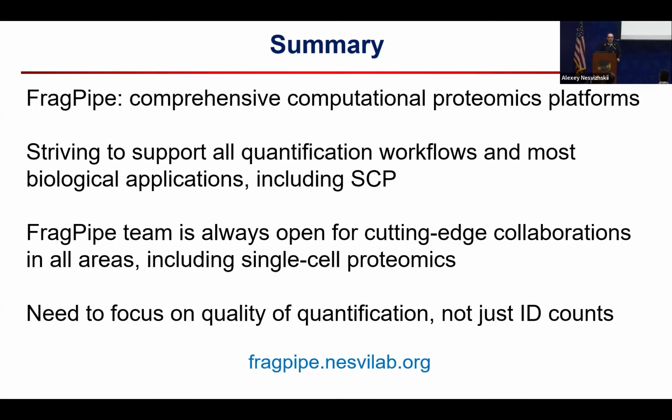It had a minimal impact using the tools that we tried at the time, which is a few years ago. I see new tools coming out, and maybe they will benefit the analysis, but I think a certain type of transfer learning has to be applied, because you can't train it on a gazillion data from the average proteomic study, right? You see what proteins are expressed in your particular study, and maybe based on that, figure out what should be the abundances of proteins that you have questions about that are not really clear identifications, right? So I think there is something to that, but it has to be in the context of transfer learning that looks deeper at what you can confidently identify in your study. Learn from that, predict the intensities or observability of proteins in that particular sample, right? For the questionable ones that would benefit from this rescoring from the predictions. So something along those lines may work.